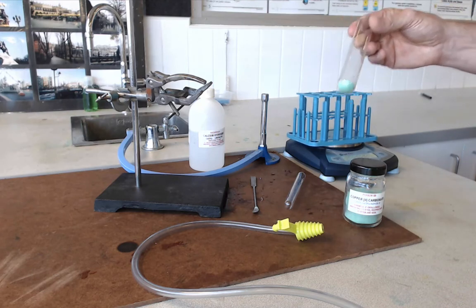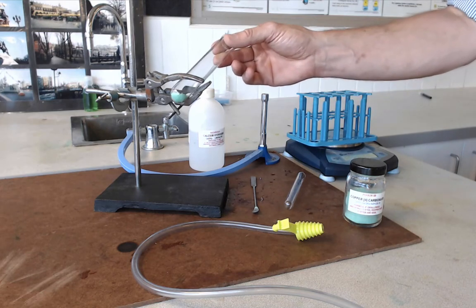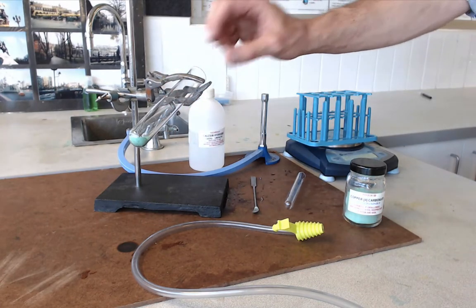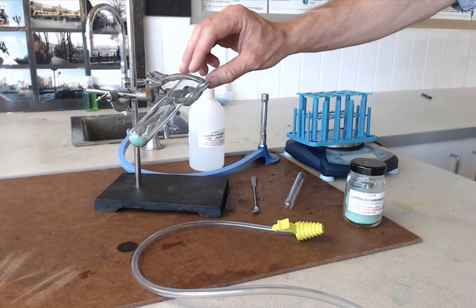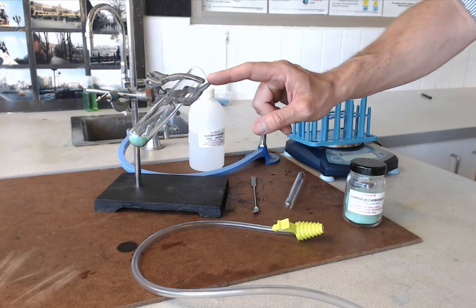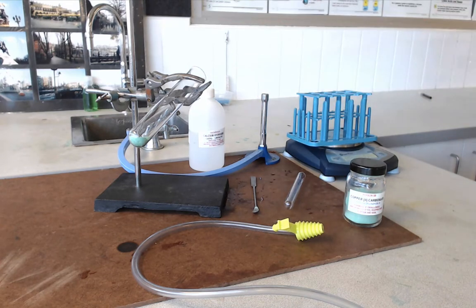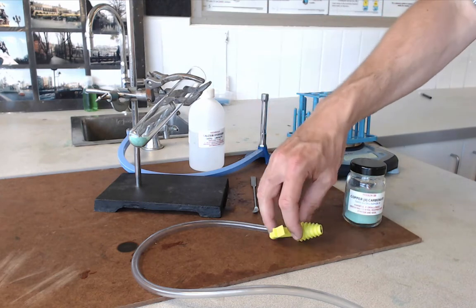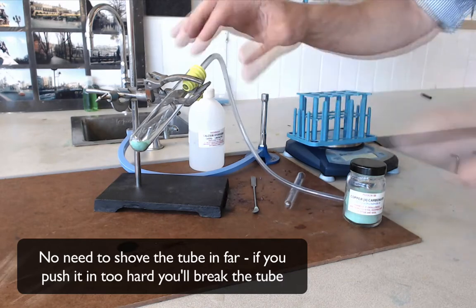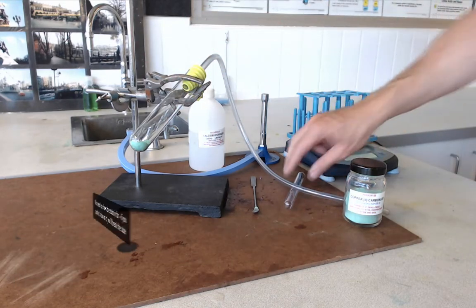Next, clamp the boiling tube because we are going to heat it quite strongly and we don't want to burn our fingers. Put it in a clamp and do the clamp up, not too tight. Notice I have clamped it near the mouth of the tube because I want to heat the bottom — clamping closer to the bottom risks heating the clamp itself. Then insert a delivery tube which will direct any gases from this reaction to the test tube.